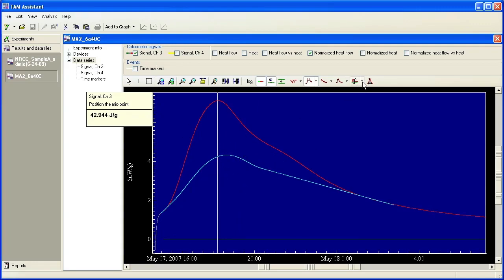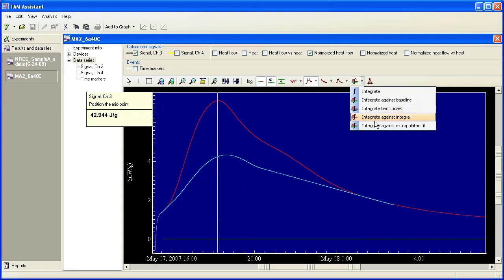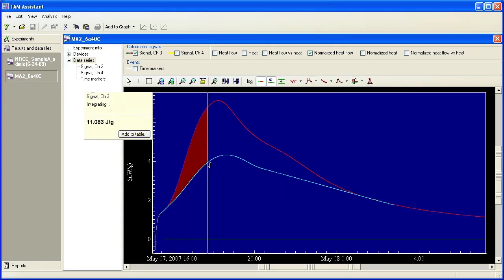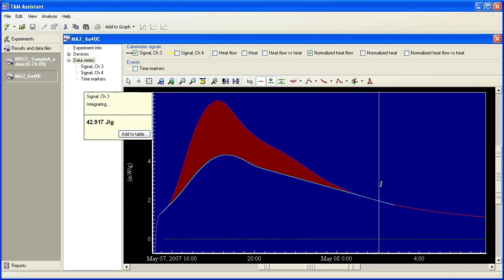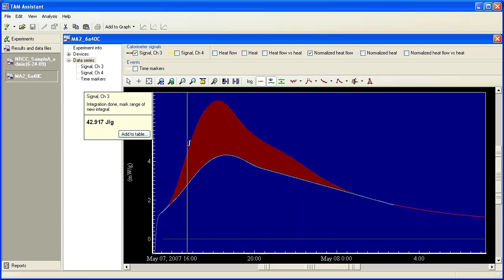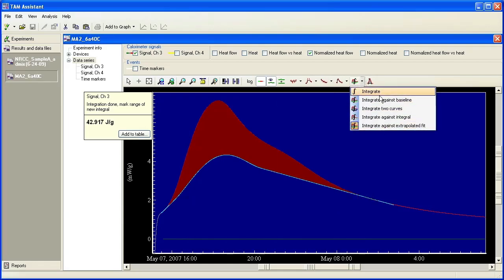And then if I go to integrate against extrapolated fit, it's activated. So now if I select this curve, I can click and drag through the file and it's going to integrate from that baseline that I just extrapolated. So here are the multiple options to integrate in the TAM Assistant software.